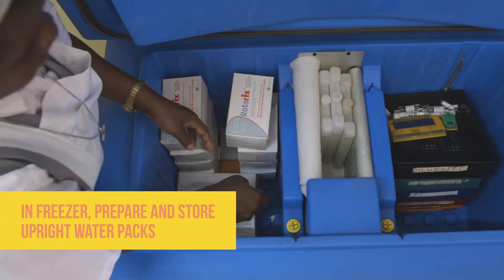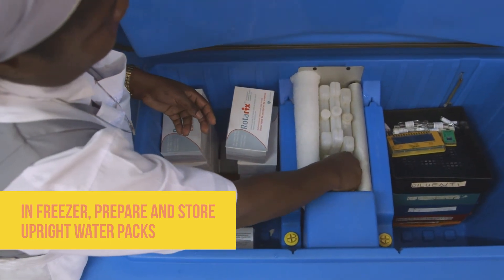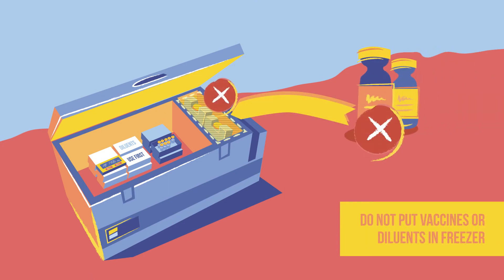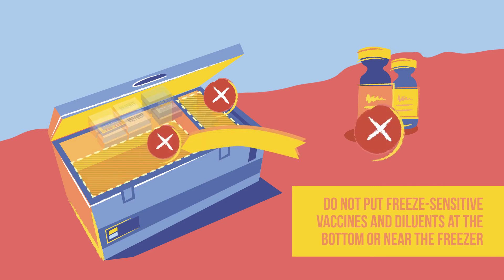The freezer compartment holds only ice packs, which are placed upright to avoid leaks. Remember, never place vaccines and diluants in a freezer. And never store freeze-sensitive vaccines or diluants at the bottom of the refrigerator compartment or near the freezer.